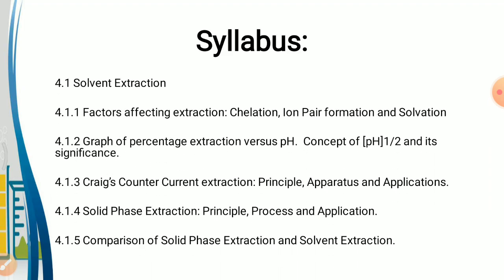Syllabus: solvent extraction, factors affecting extraction, chelation, ion pair formation, and solvation. Then, graph of percentage extraction versus pH, concept of pH half and its significance. Craig's countercurrent extraction, principle, apparatus and applications. Solid phase extraction, principle, process and application. And then comparison of solid phase extraction and solvent extraction.